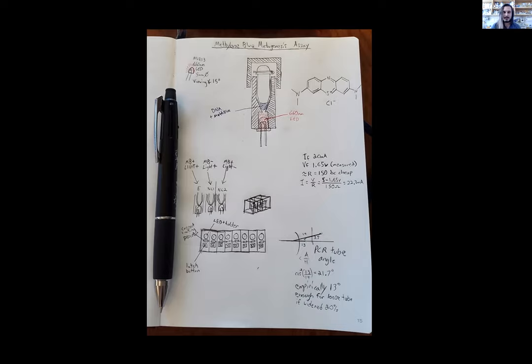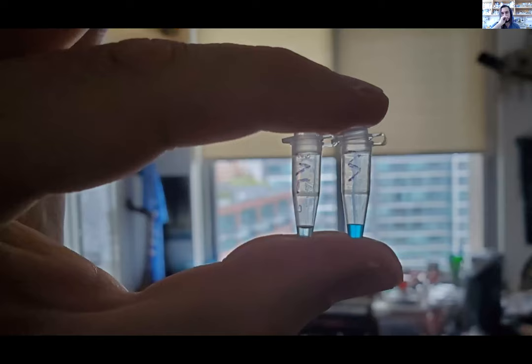And so after a little bit of rapid prototyping, I wired up some 660 nanometer LEDs. I bought them online, put them on a breadboard, and used three samples. This one just shows two. But I did three samples, and I exposed them to either the light on, the light off, with methylene blue or without, right? And this was the result of these two samples. ML means methylene blue and light. M is just methylene blue without light. And you can see on the left side that the tube actually got clearer, right? And in that clarification is the reaction. So the methylene blue is reducing and releasing oxygen radicals as a result.